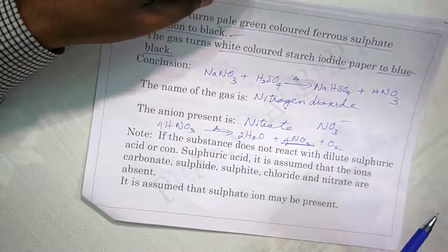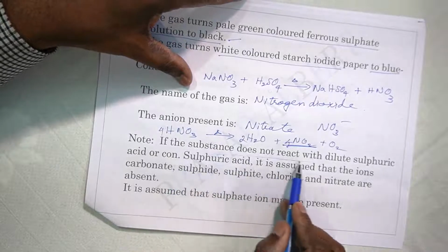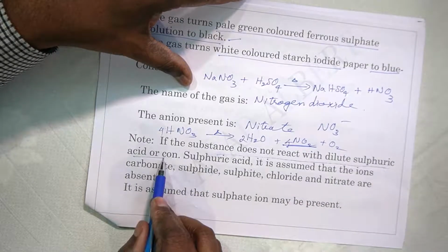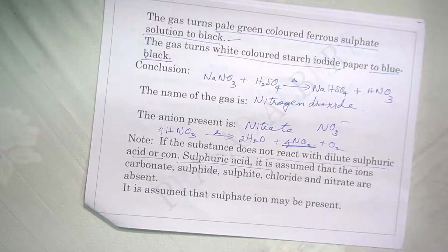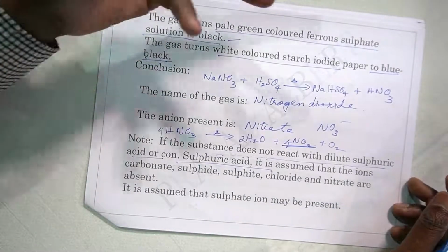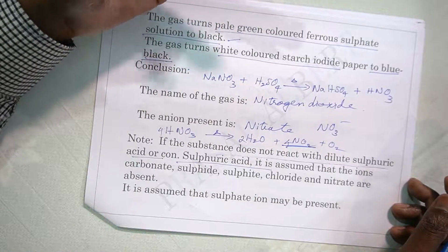Now the next thing to note is, suppose the substance is not reacting with dilute sulfuric acid or even with concentrated sulfuric acid. That means none of the ions mentioned above is present, that is carbonate, sulfide, sulfite, then chloride and nitrate.